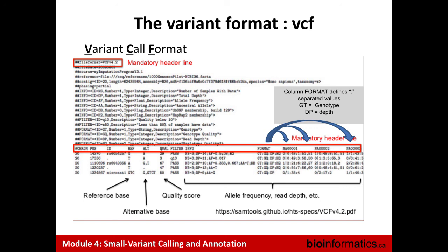So I say if you have uniformized how your samples have been generated at the beginning, same library kit, same exome kit if you're doing exome, same instrument, and if you see that your run works the same way and everything is okay, I would include. So with GATK, what you will do is usually individual GVCF, which is a way just to collect information on your sample without doing anything. Then you will merge your samples by batch of GVCF, and then when you merge your batches, you will do the variant calling and genotyping.